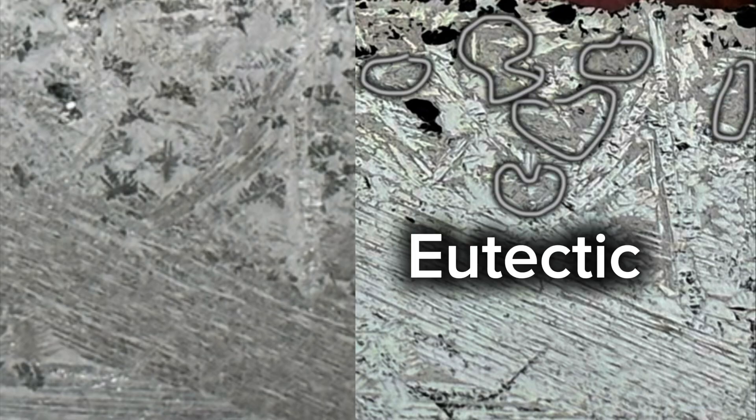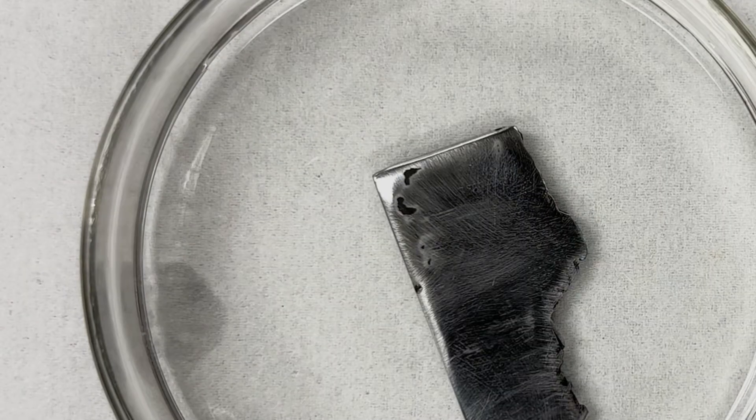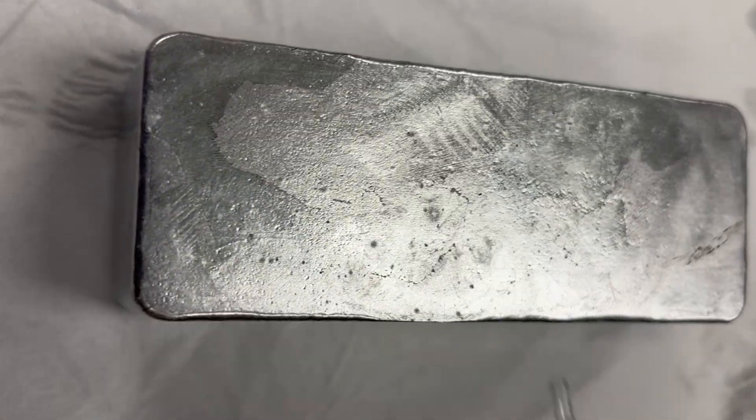Let's take a closer look. This dark background material that we see is a eutectic between the alpha aluminum and the theta aluminum — that means it's a dual-phase material, and this is key to understanding why we're losing contrast upon etching. You can see that the eutectic turns from a nice dark gray color to a more white color. For comparison, here's etching a real meteorite with a nitric acid-based etchant — you get some nice contrast, but if I were to use this same etchant on my ingot, nothing would happen at all.